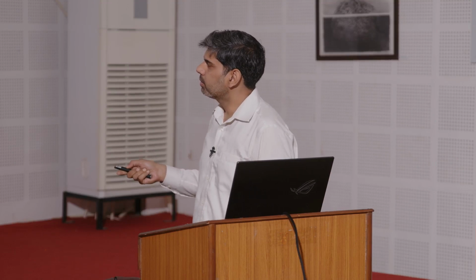So, what we get at equilibrium is a diffuse layer of ions where you have more positive ions near the surface than negative ions, because we have to maintain net electroneutrality. Now, this layer where you have more positive charges in the fluid is really small, you can't see it, okay, but the effects of this are what you can observe.